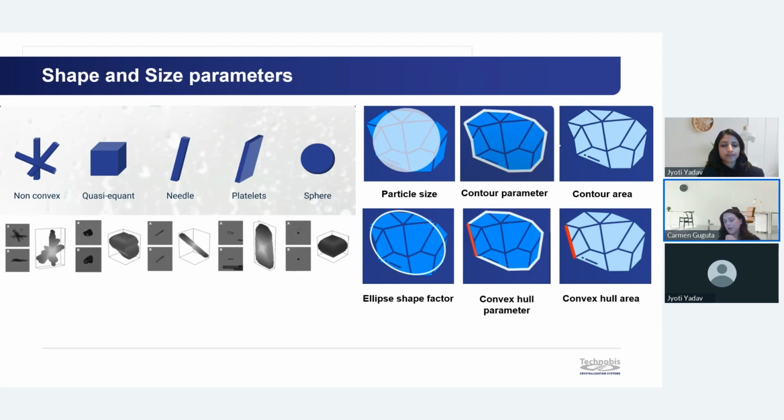And the added value of this software is that with the oldest way of image analysis or particle recognition, the biggest trouble would have been that if you have two overlapping particles, in most of the cases, and in many software packages available out there, they would have been seen as one big particle.